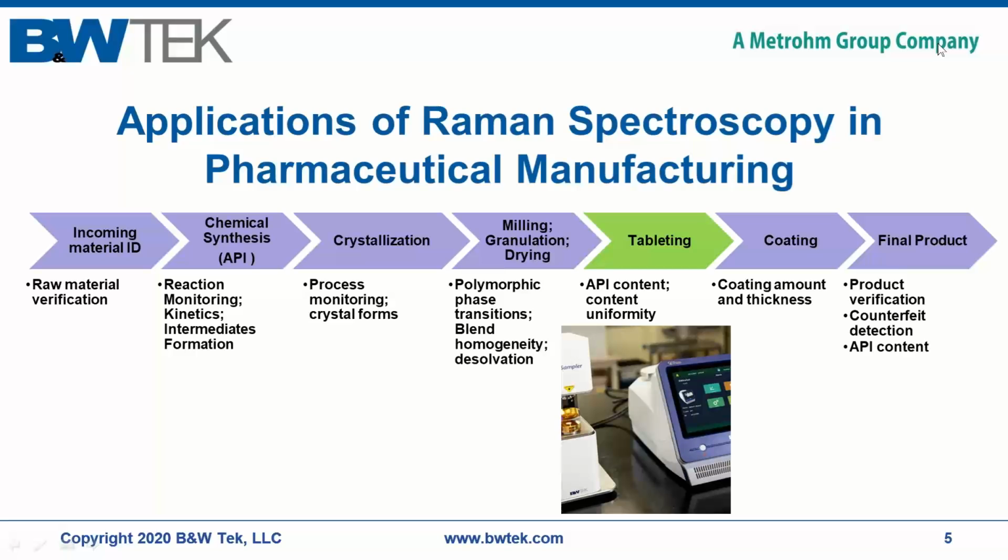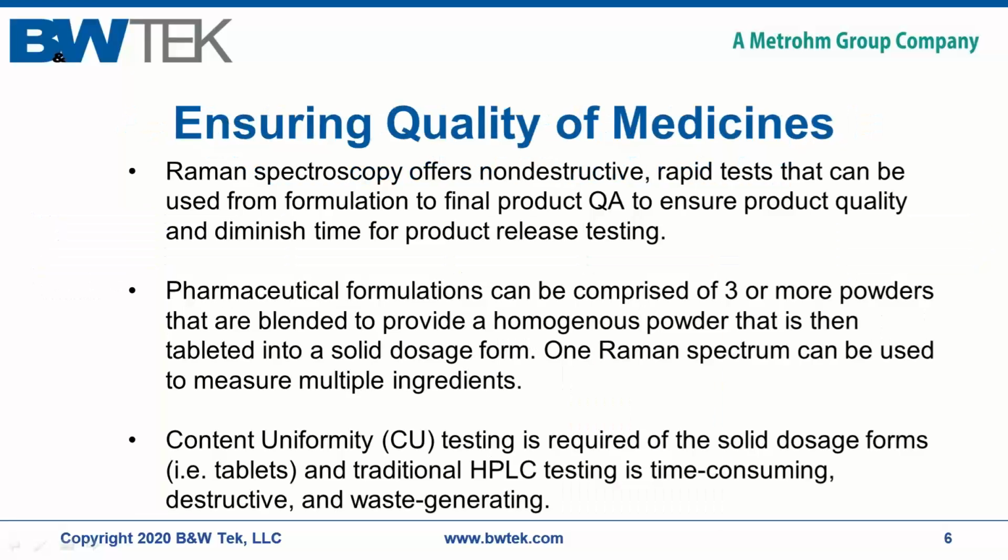So today, our focus again is on content uniformity using transmission Raman spectroscopy. The other application areas, we have many application notes on, and we're happy to talk to you about, but for today, we're focusing on our content uniformity testing. But one of the first things to consider is, why do we use Raman?